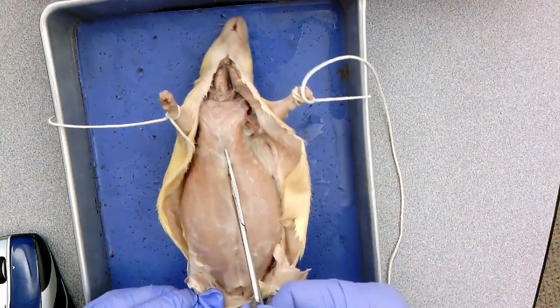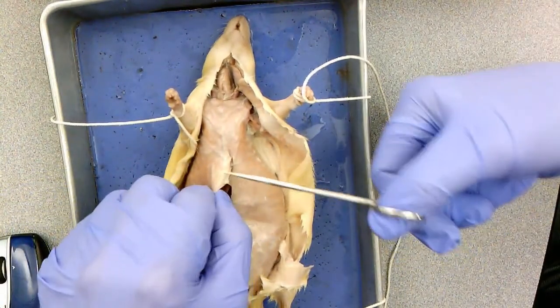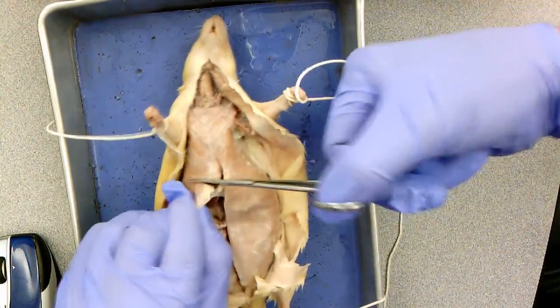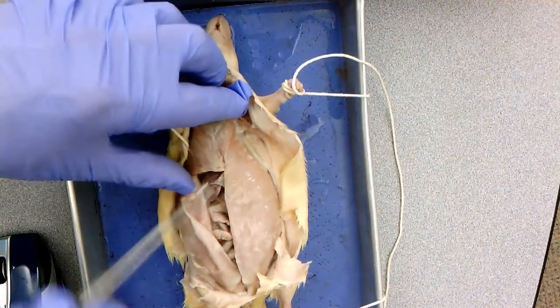Once I get to that rib cage, I'm going to come lateral. There's going to be some juices that come out, and that's okay as well. I'm just going to make an incision this way, and then I'm going to make a cut the other way with my scissors.